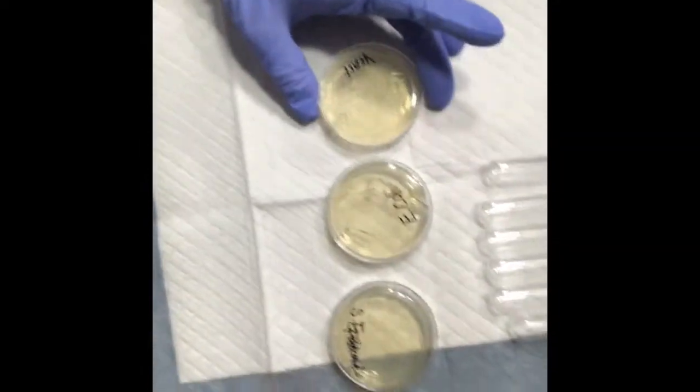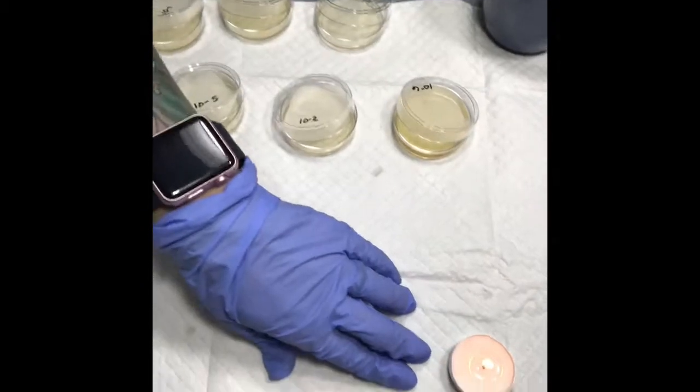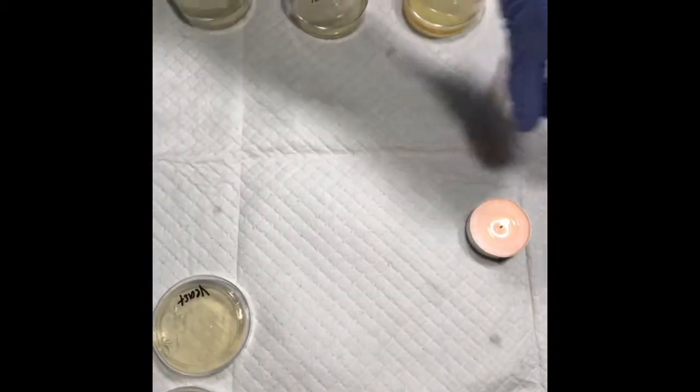And I have my stuff here, my candle, because you have to sterilize every time you open your culture. You have to sterilize the lid, the lip of the vial every time, when you open it and then right before you close it, just to prevent any other organisms from entering your culture. And I guess I will check back in 48 hours and I can complete my assignment.